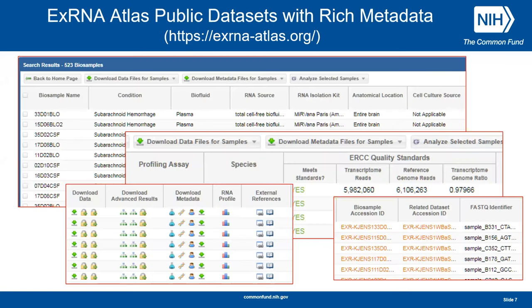This slide shows that we have actually spent quite a bit of time just defining the Atlas data model. It's very important both to the consortium and to us to make the data readily available, not just within the consortium, but to the broader community. So I think we have over 1,500 metadata fields defined, so one can do searches on a variety of different fields and do sorts, et cetera, download the data, or select that data and submit it to various tools.